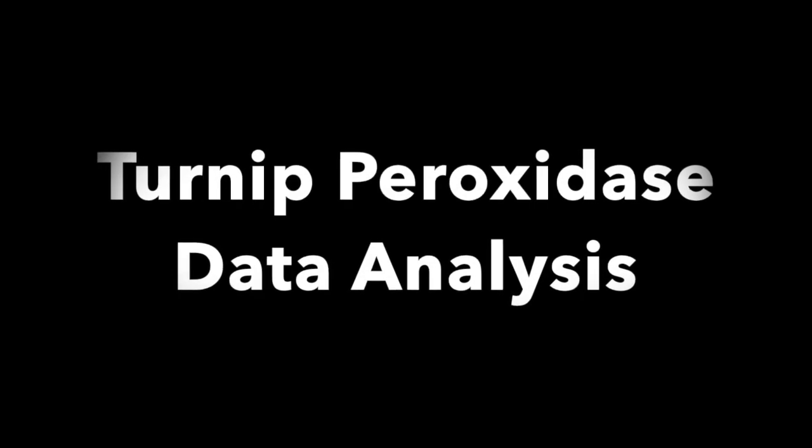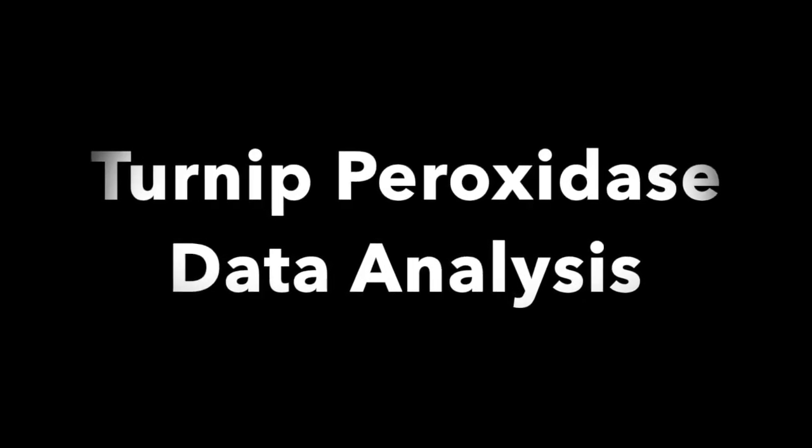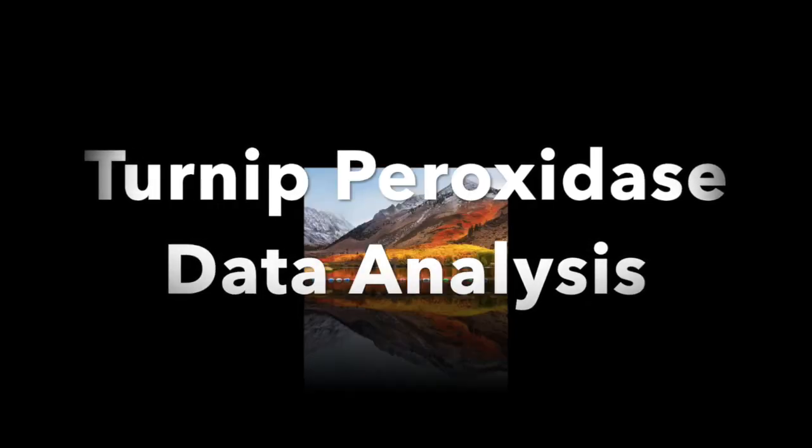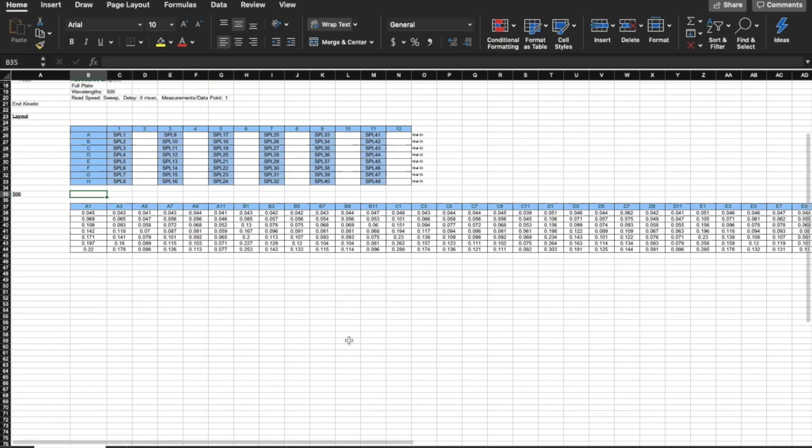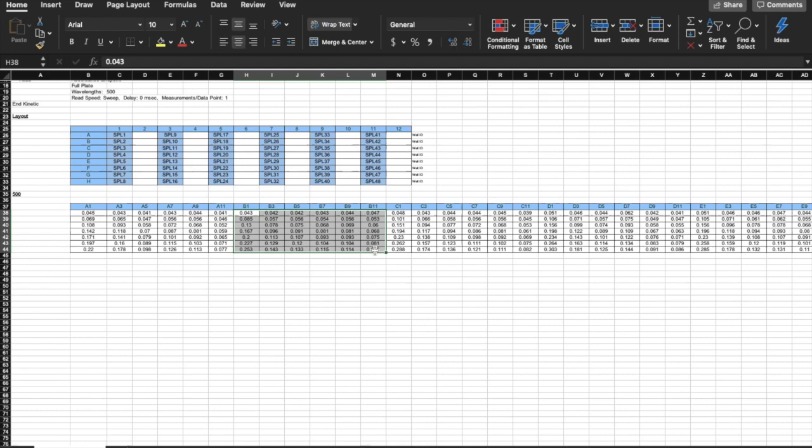I will show you how to write up the data for turnip peroxidase lab. You should have the recent JMP downloaded onto your computer. First, we're going to analyze data for range finding.